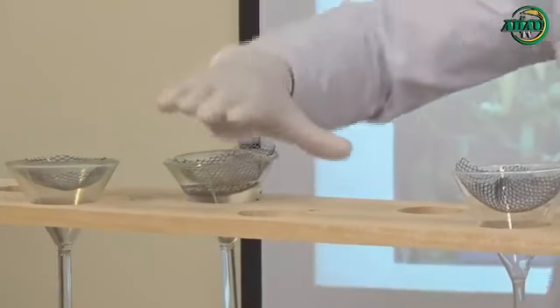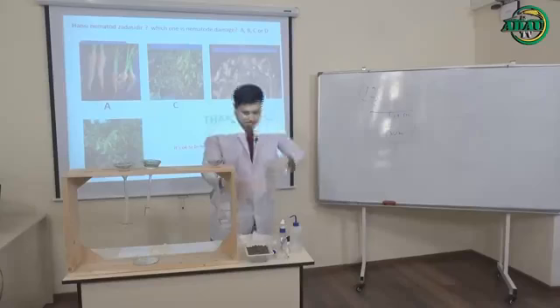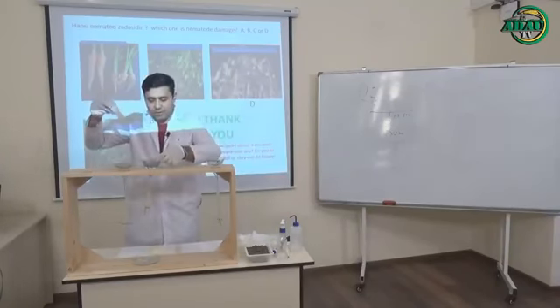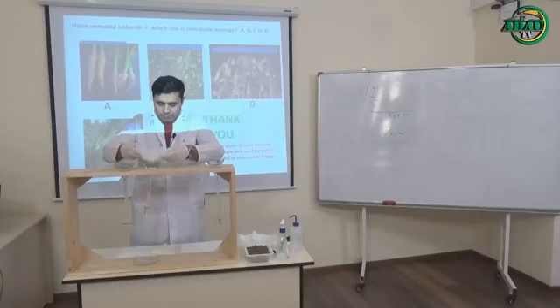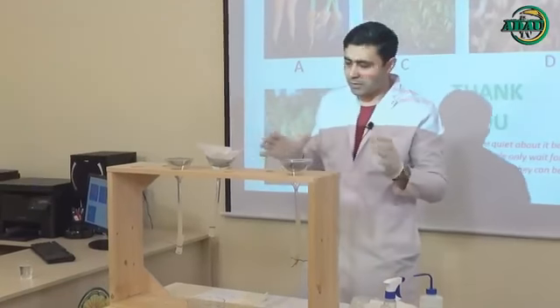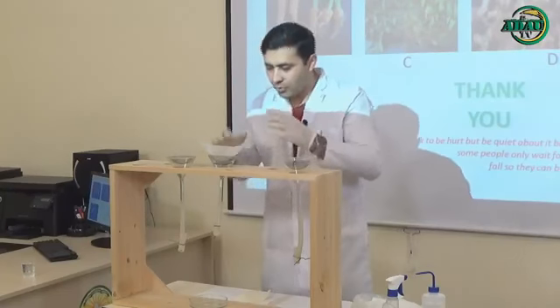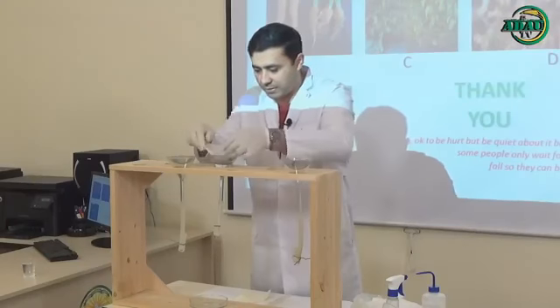Already I added the water here, and actually you have to use gloves. So the next step, napkin. Take the napkin and put it inside the sieve, like this. But at this point, you have to take care a little bit about your napkin. Why? Don't push the napkin and don't destroy your napkin.